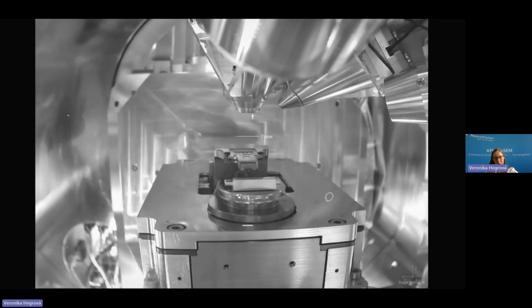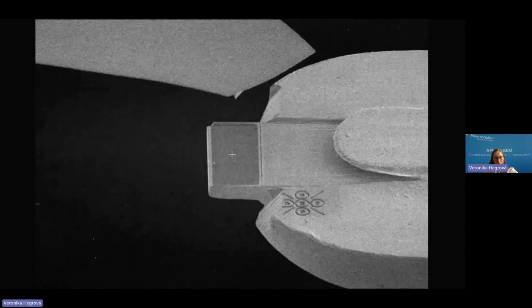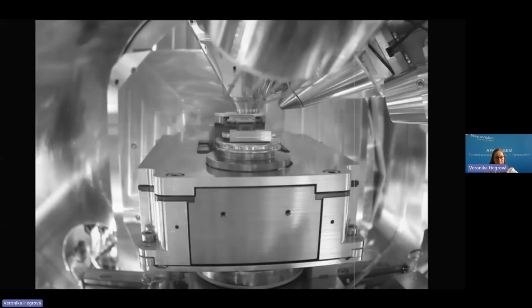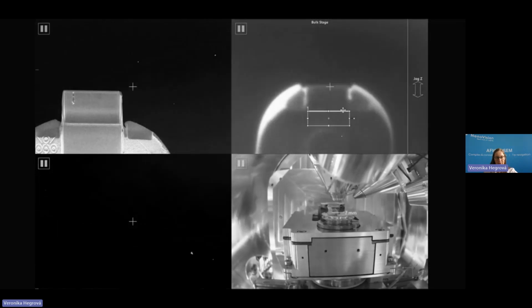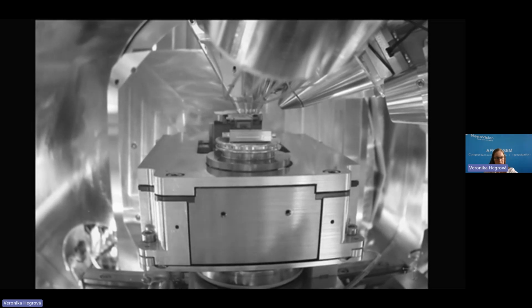First we lower the working distance and navigate the tip approach to the sample and measure. Then we rotate the sample for FIB milling. And analyze the lamella again.